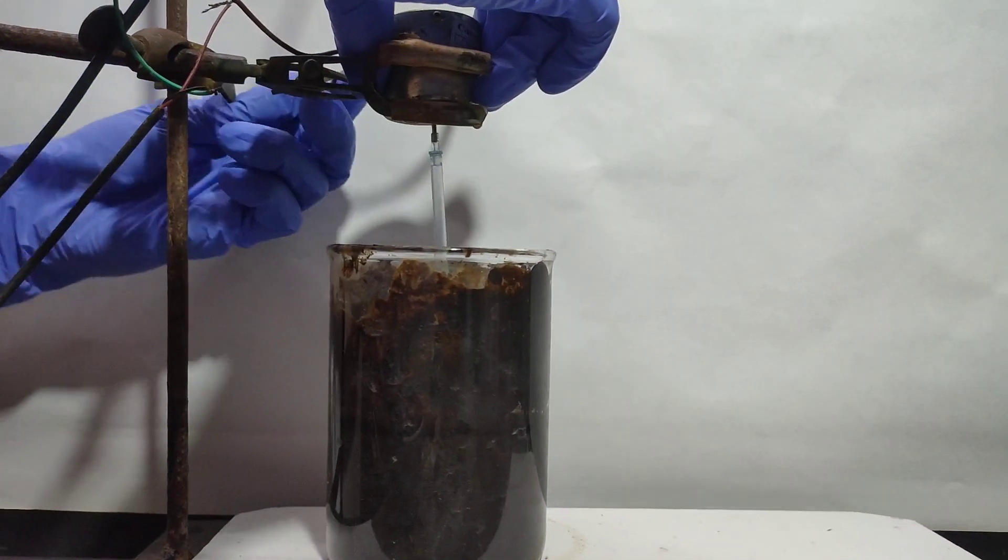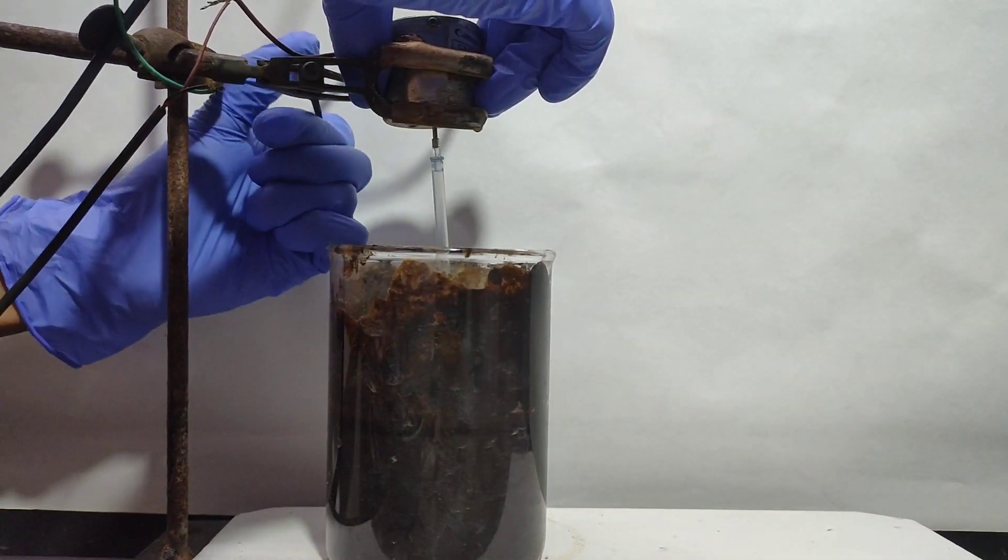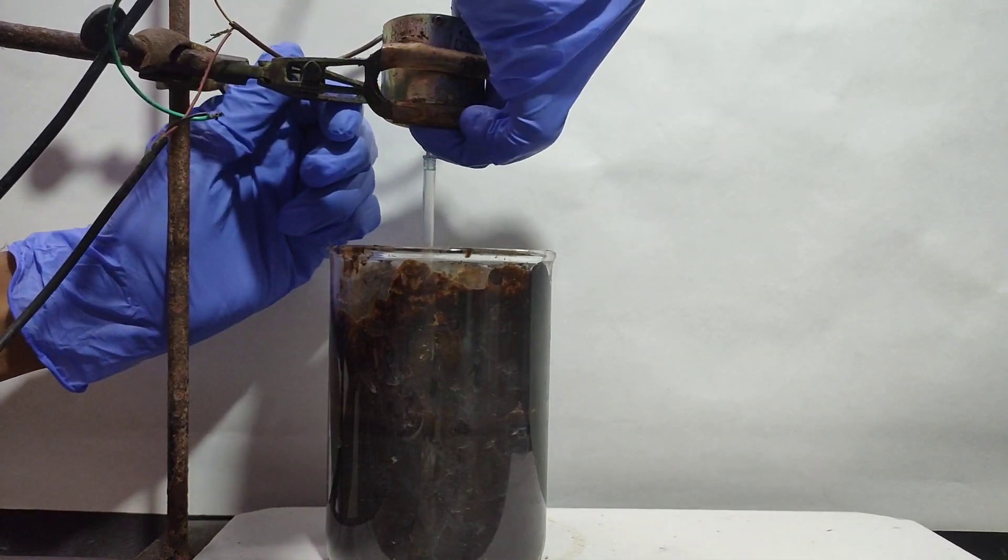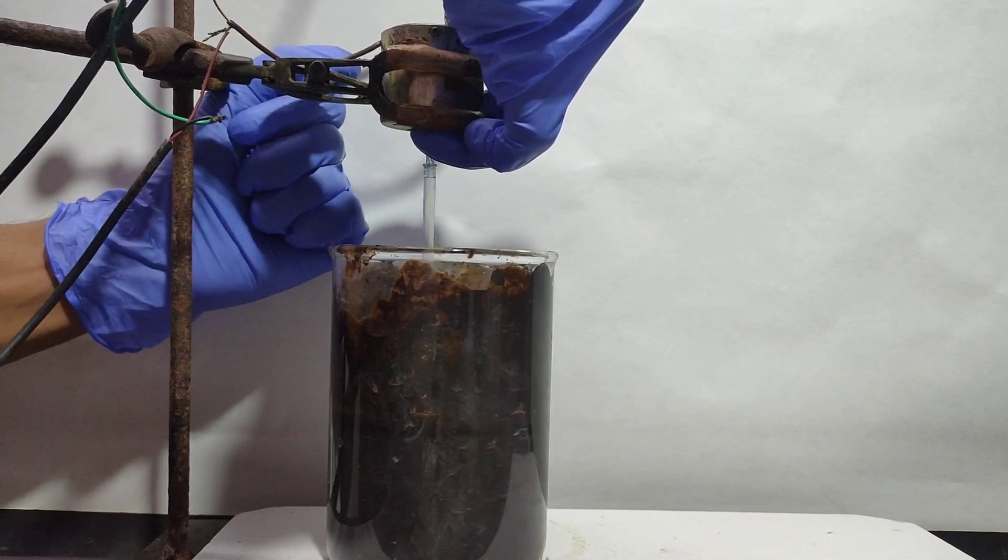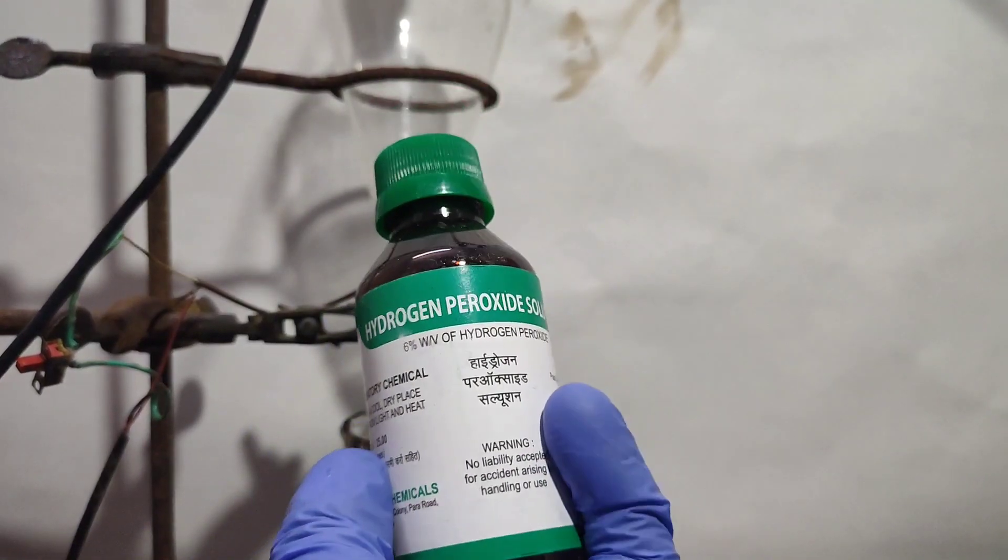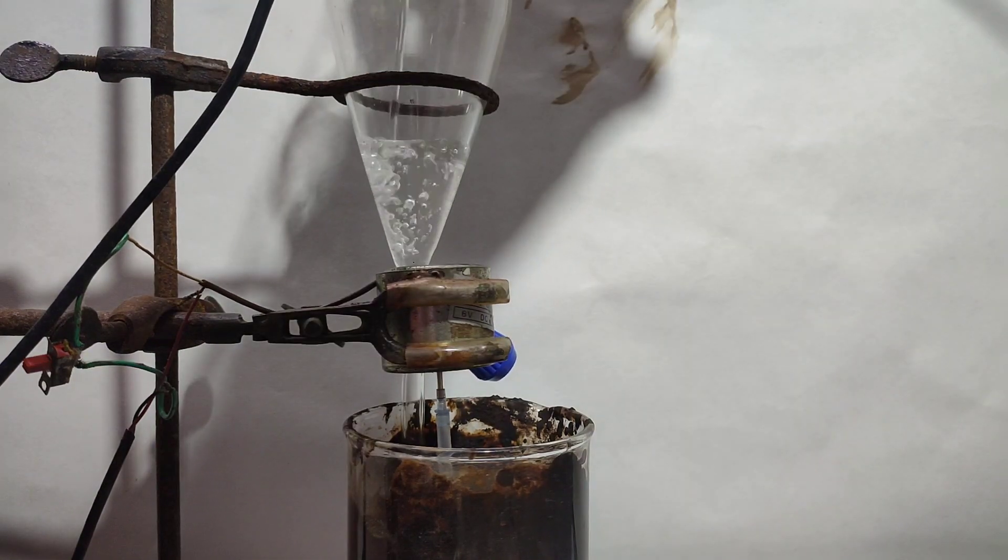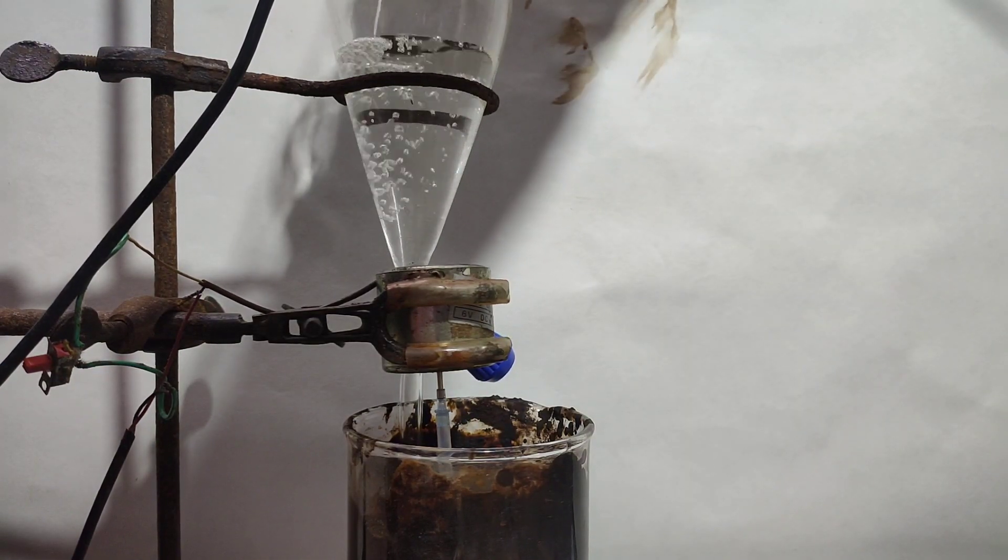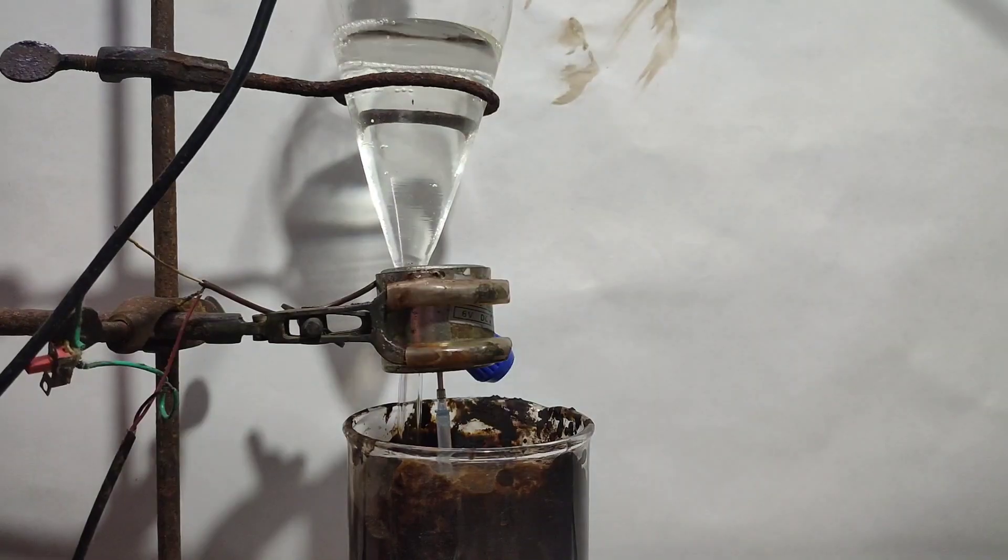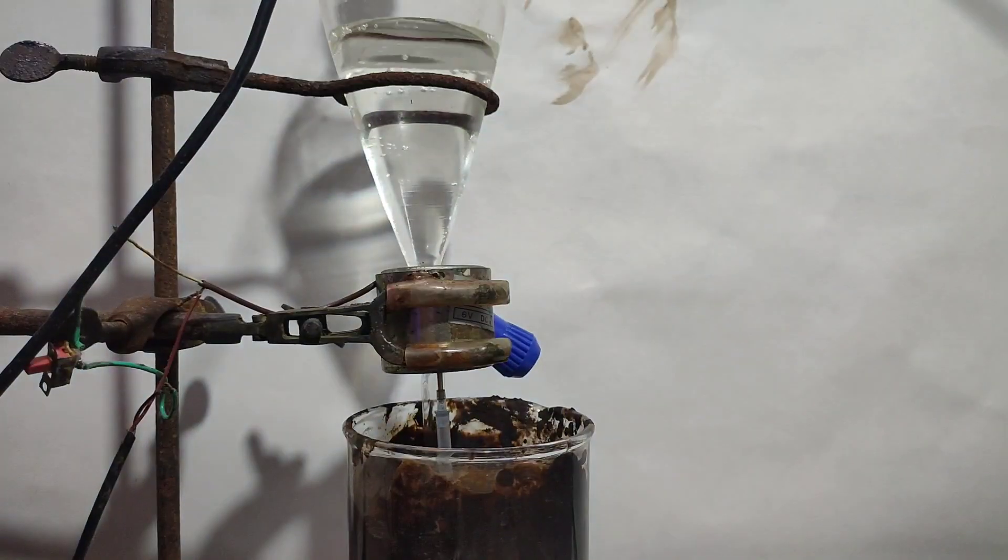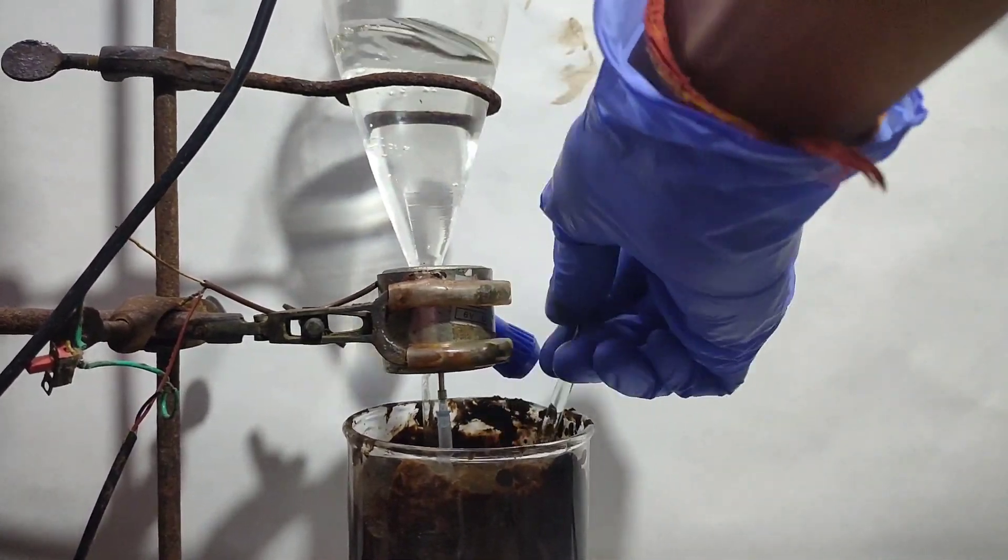I attached a stirrer to stir this slurry, but it wasn't effective as the slurry was thick and viscous. Manual stirring was required. Then I placed 100 ml 6% hydrogen peroxide in a separating funnel and added it to the slurry dropwise with constant stirring. First I manually stirred the mixture.